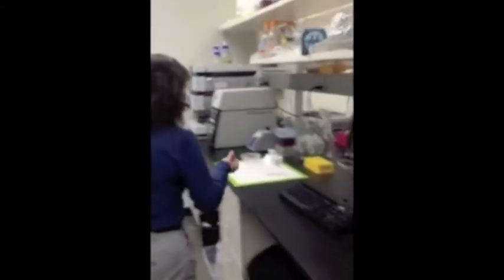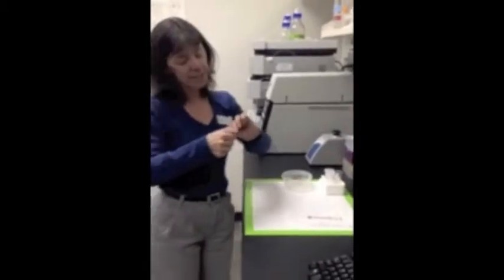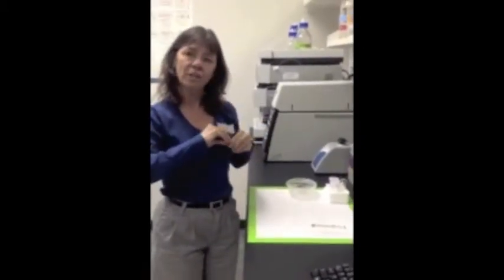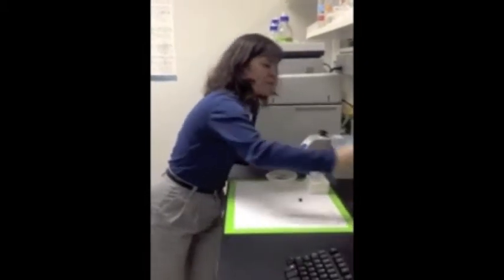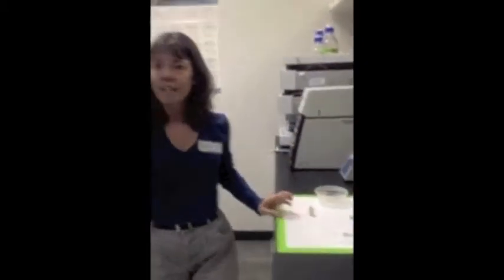So we get the samples from the microdialysis experiments that Jessica will tell you about. We actually start out with very tiny samples. I don't know if you can see that, but this is about 40 microliters of sample. We can get multiple samples for each subject, though, so we can look at changes across time in these neurotransmitters.